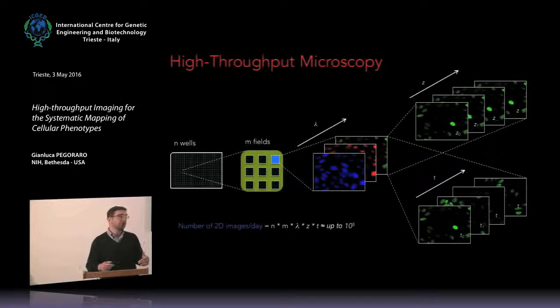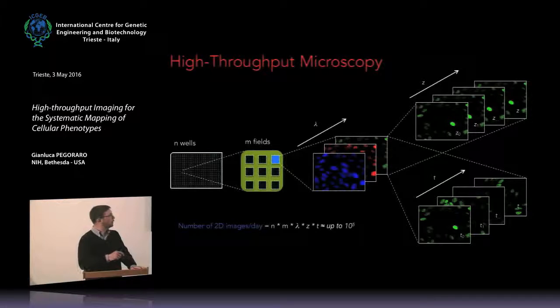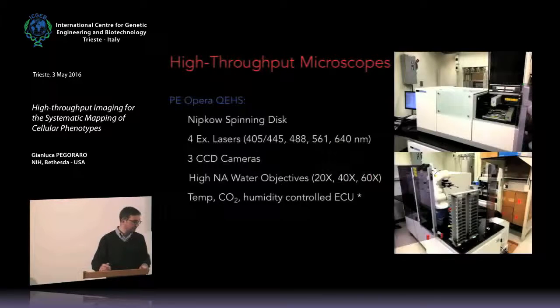So from a practical standpoint, usually researchers tend to focus either on this part and then maybe probe several thousands different treatments, but maybe limiting or completely eliminating Z-sectioning and time-lapse, or rather using fewer experimental treatments and maybe focusing on getting more detail, more information about the three-dimensional information and/or the temporal dimensions of biological processing questions.